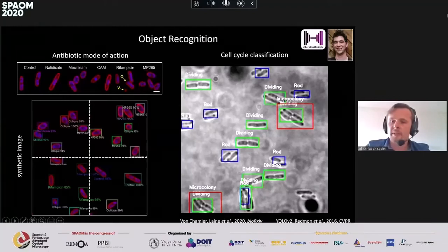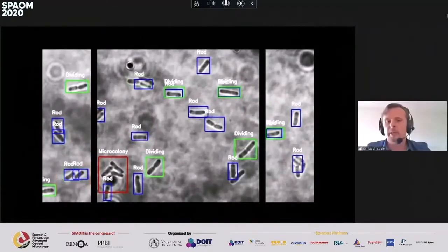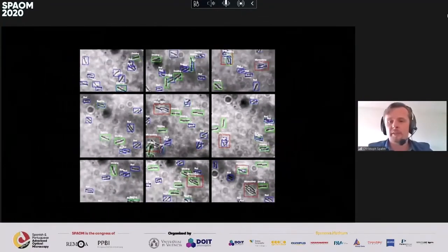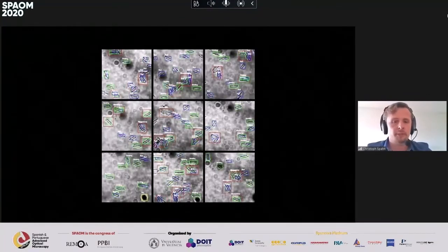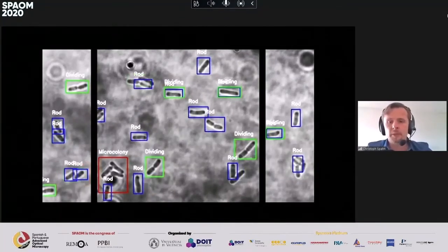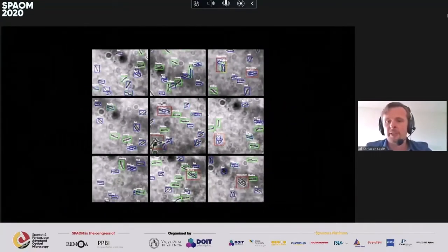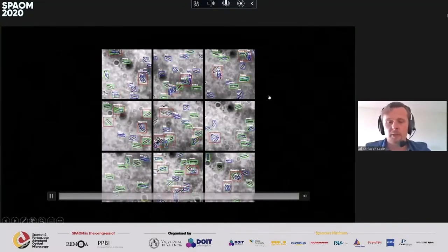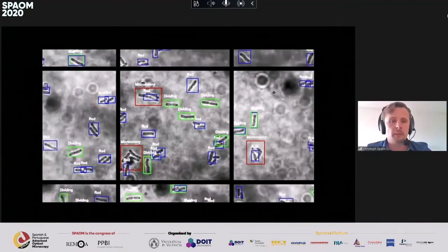You could just tell this to the microscope, and then it can autonomously acquire data in large amounts that is then very well suited to perform your analysis and research. And I think this is where microscopy is going, automating processes based on assumptions that you tell the microscope beforehand. And I'm really curious where this will end.